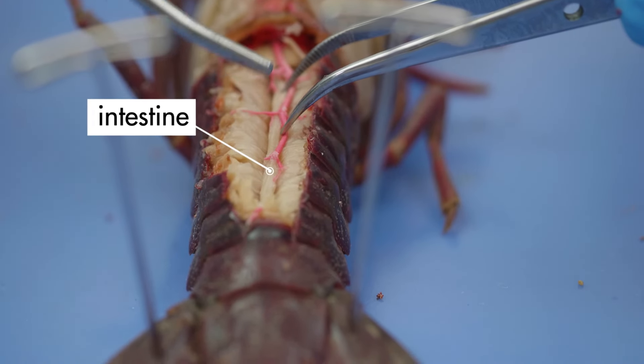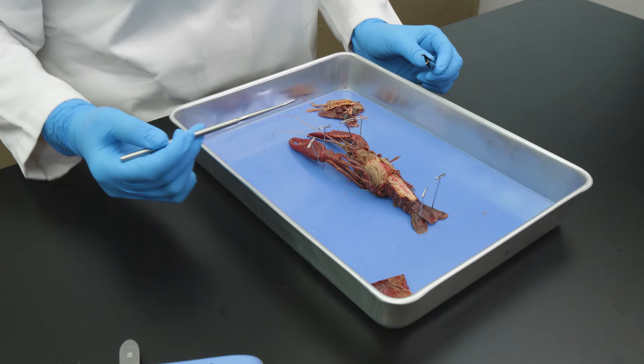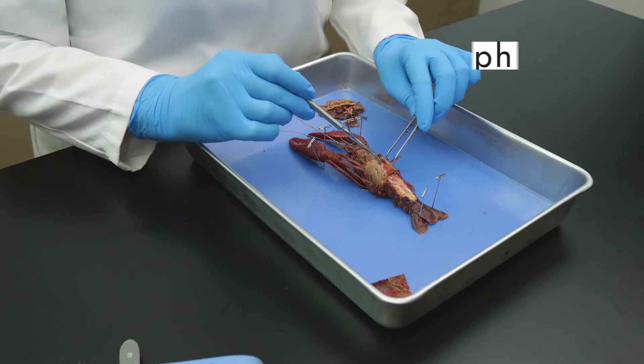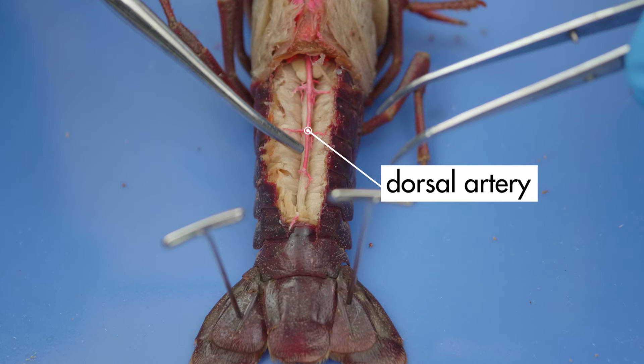This line extending the length of the abdomen is the intestine, which ends at the anus. The crayfish has an open circulatory system, which pumps hemolymph instead of blood. Its heart is located above the pyloric stomach. We can also see the dorsal artery, which carries hemolymph away from the heart.